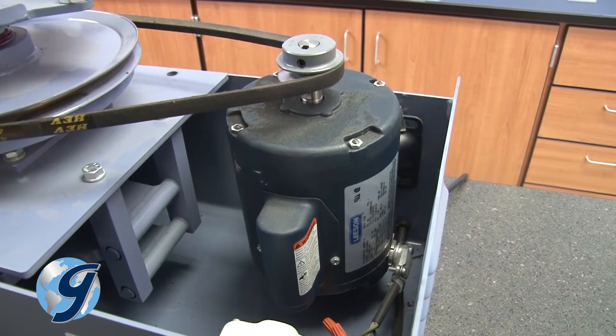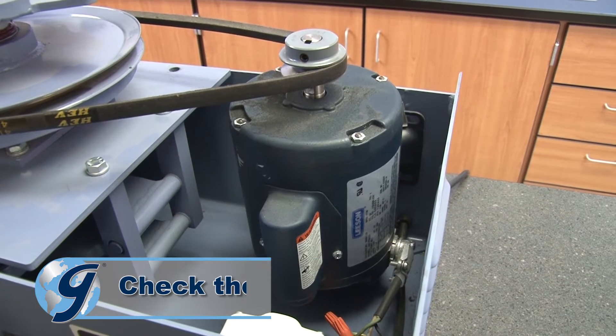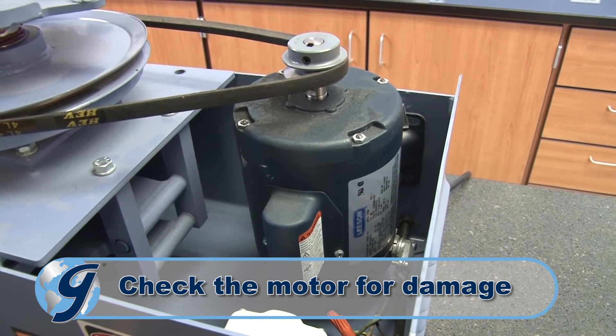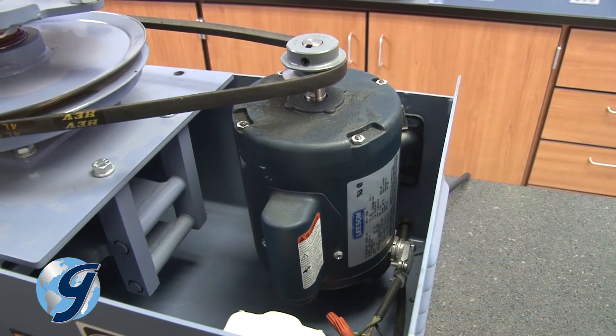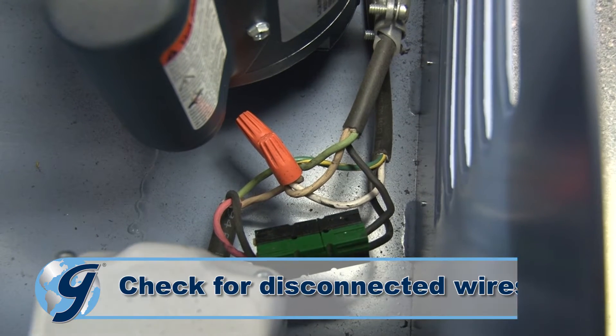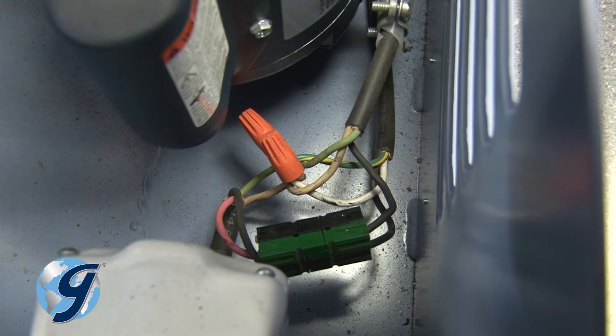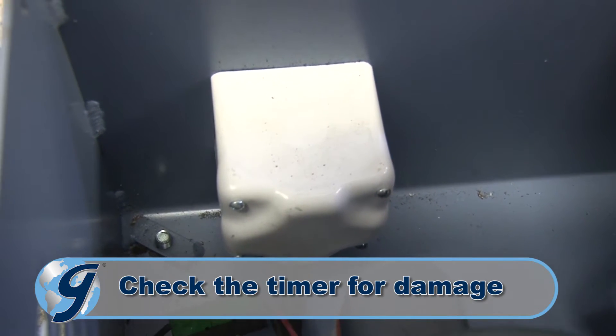If the drive belt appears operational, then visually check the motor for any irregularities such as damage or burn marks. Next, check all wiring for any disconnections. Now check the timer for any signs of damage.